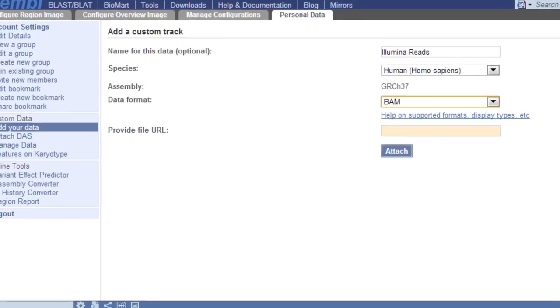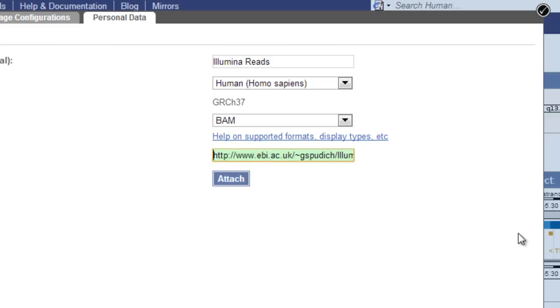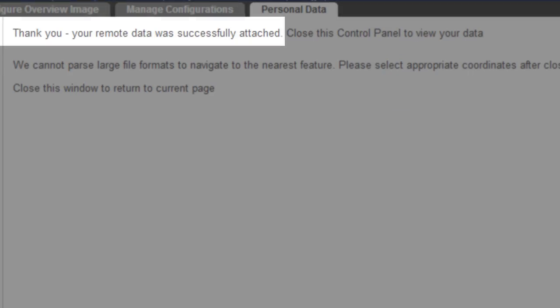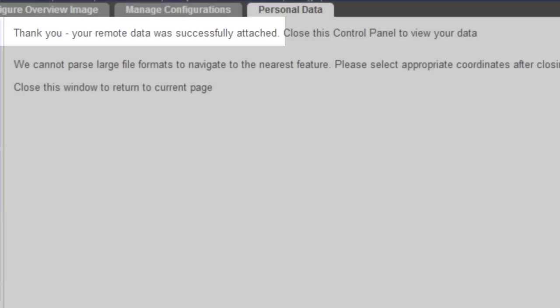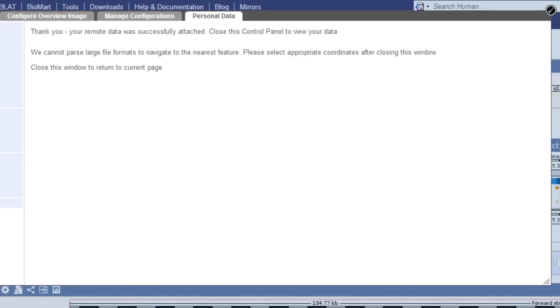I can now put in the URL of the BAM file and click Attach. Note I didn't see an upload option, only a URL attachment option. That's because BAM files are too big to upload to the Ensembl database, so only URL attachment is possible for that type of file. We'll do another example in a minute where we upload a file directly.